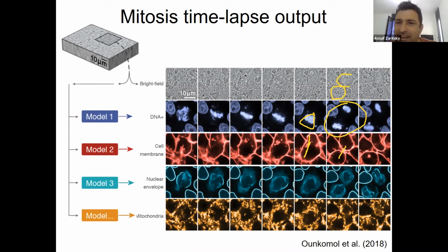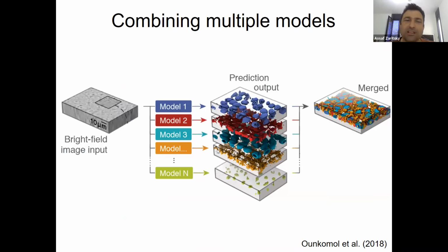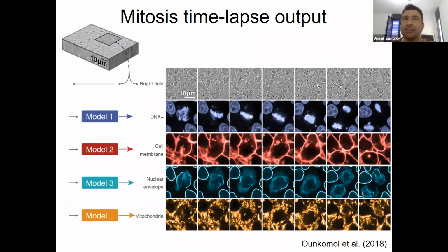The ability to do this mapping from a bright field to a fluorescent image means that the bright field images contain implicit hidden information that allows us to do this transformation. The texture of the image within the bright field contains the information that allows this reconstruction of where the organelle within the cell is located. It's pretty amazing.